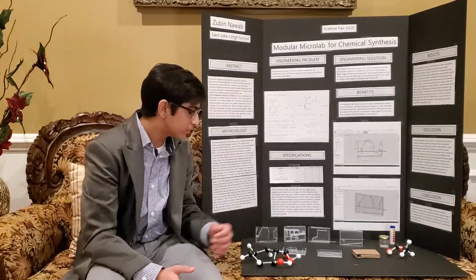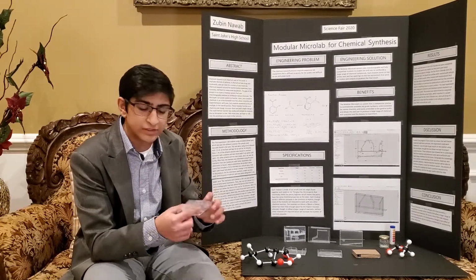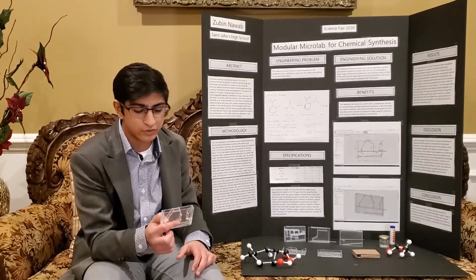So for future use, as I said before, I would probably use different materials. I would also use laser cutting if I were to use acrylic again in the future.